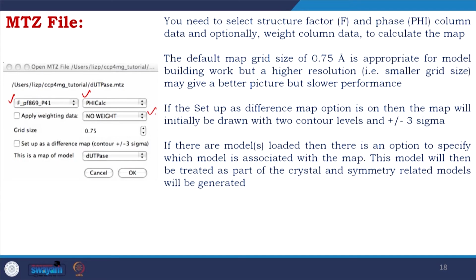So, what it is talking about, suppose you have this electron density and you have 2 PDBs. This is a tyrosine suppose, and this is here, and there is another tyrosine coming from another structure.